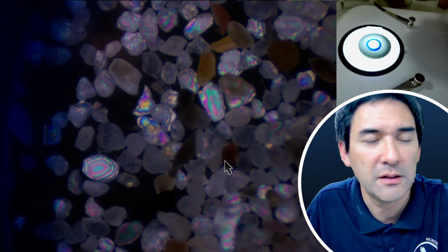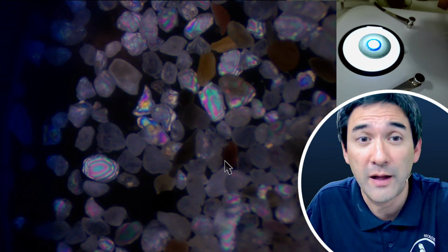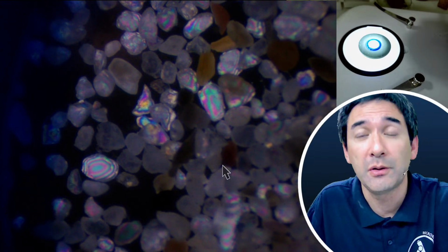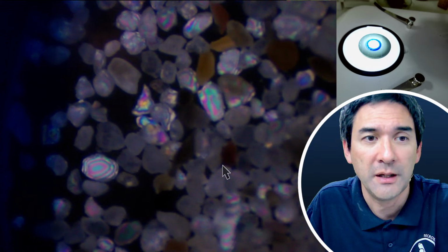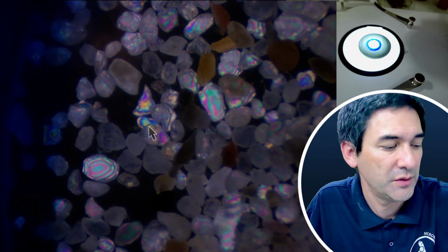Many things, if you put some hair or some cotton fibers between cross polarized filters, they're going to appear bright because the light simply becomes depolarized. But I think especially nice is if different wavelengths of the light are cancelled out differently, and then you get those rainbow colors.